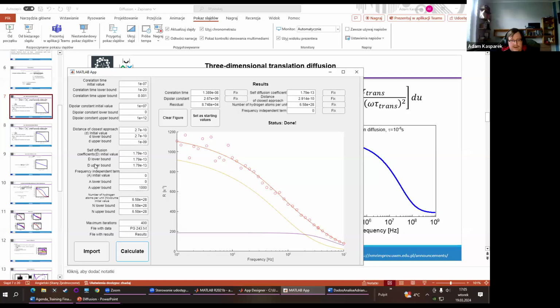But if we have done this, then for the next part we get some fit which makes sense. So I'm putting this as the starting value. The fit will go from here, and I will start this.